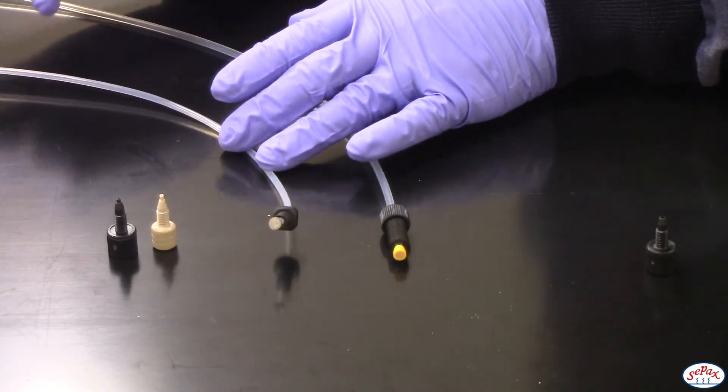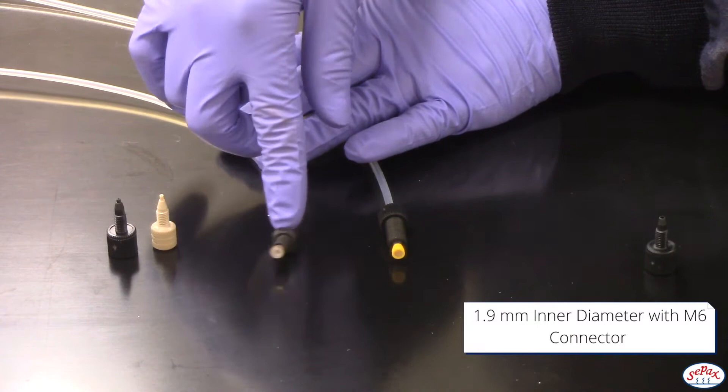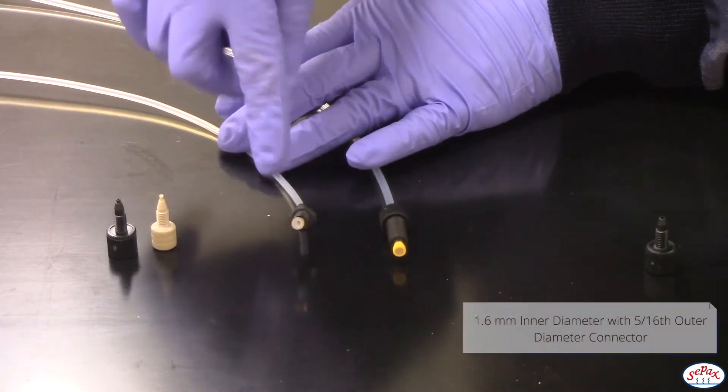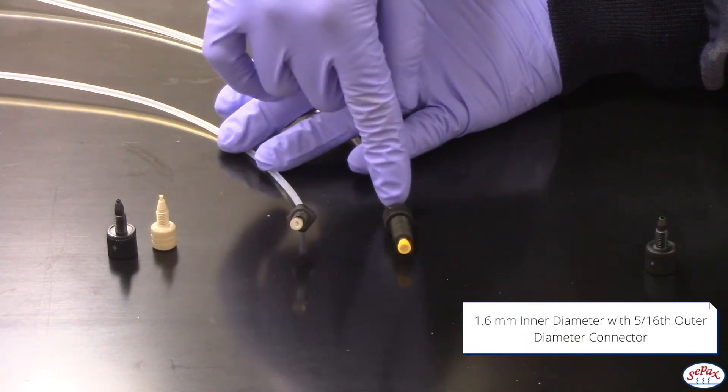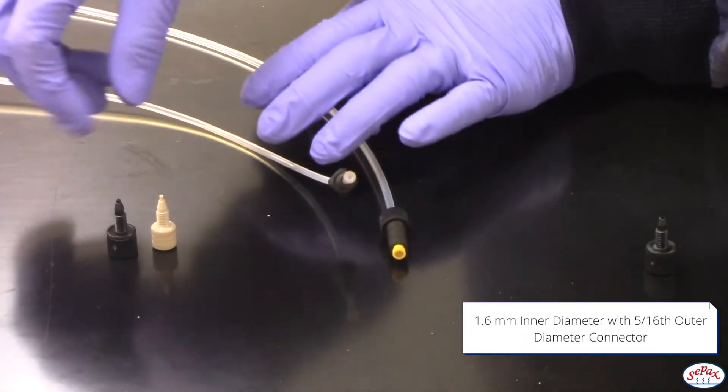For the larger diameter columns, we recommend using larger tubing with an inner diameter of 1.9 millimeter with an M6 connector, or tubing with an inner diameter of 1.6 millimeter or 1/16th with a 5/16th outer diameter connector.